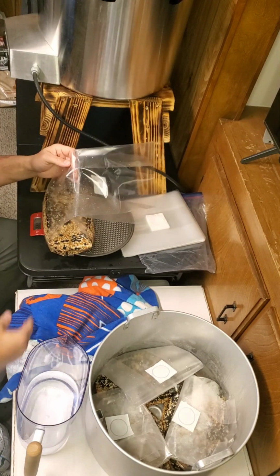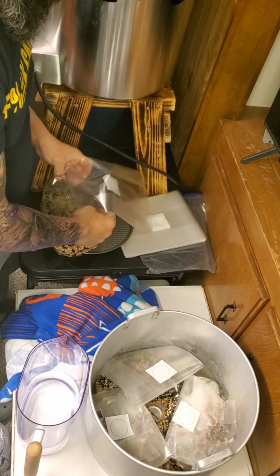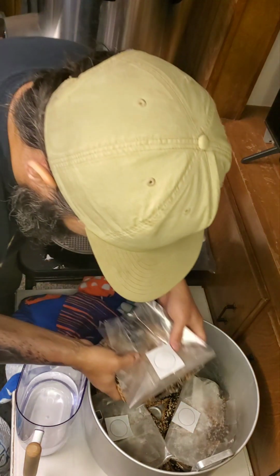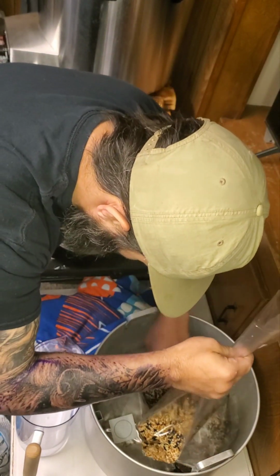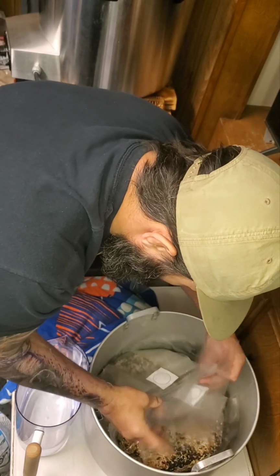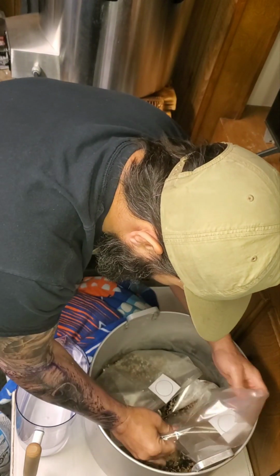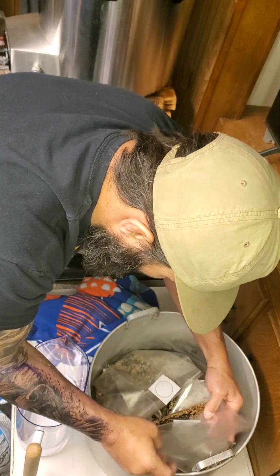And I use warm water too, just so you know. I feel like it prevents the bag from possibly ripping, because sometimes, no matter what bag I use, they feel a little brittle. These Amazon ones are definitely my favorite so far. And like I said, I haven't had any issues sticking. I did a couple videos before I showed you. It's a whole better shape once I get the other bag in there.